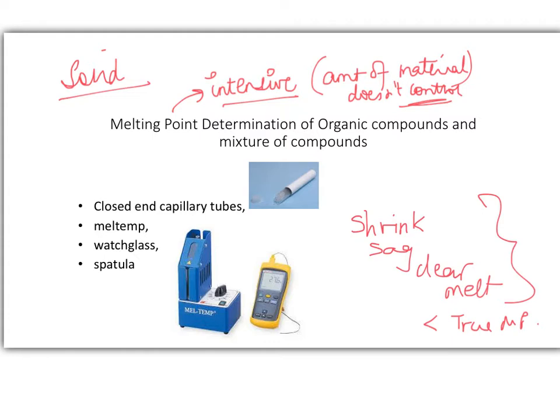It is worth mentioning that the amount of impurity as well as the nature of interactions between the impurity and the compound will dictate how broad this range would be. That means you can't really predict how the behavior of a certain compound is going to be unless you run that sample. Obviously, you're expected to have run the experiment following the instructions and protocol. Otherwise, you might feel that the sample given was impure. On the other hand, it might just be a source of error based on how you handled that particular compound.